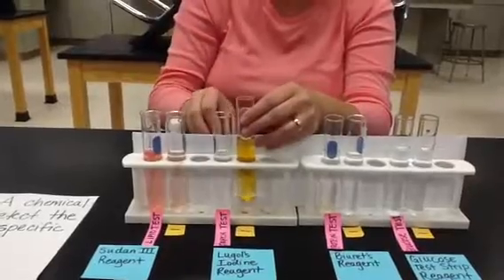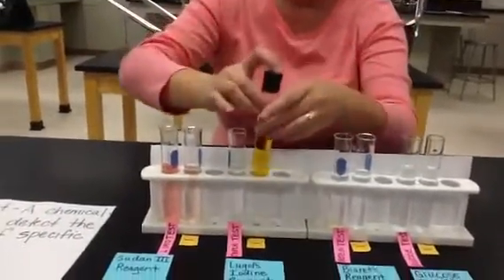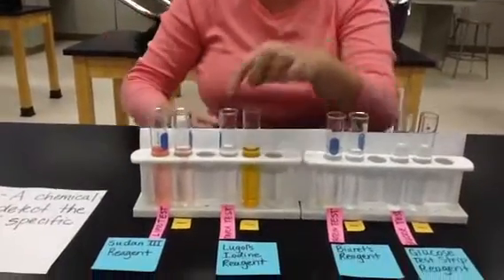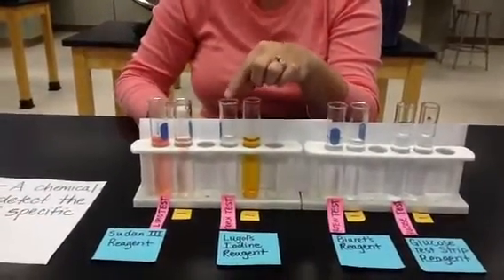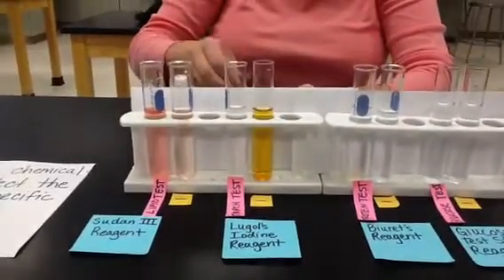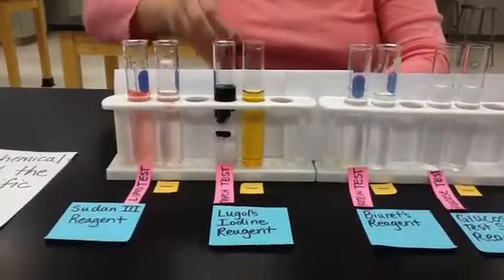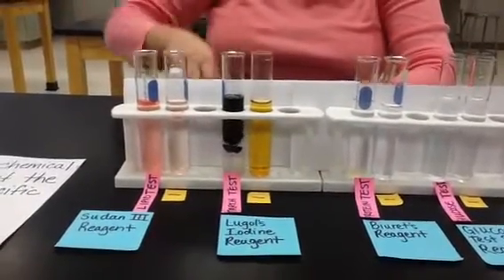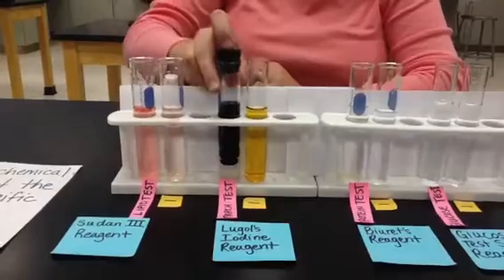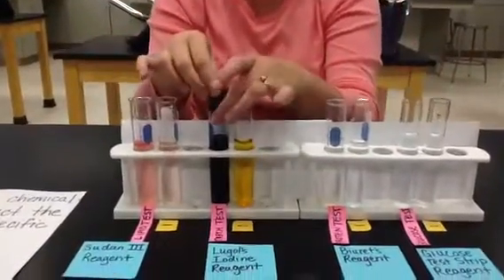And if it's a positive test, so we're hoping this is positive and has starch in it, it should turn a dark blue, almost black color. And I think that's what we're seeing. I'm going to mix that one up, and that's what you should see.